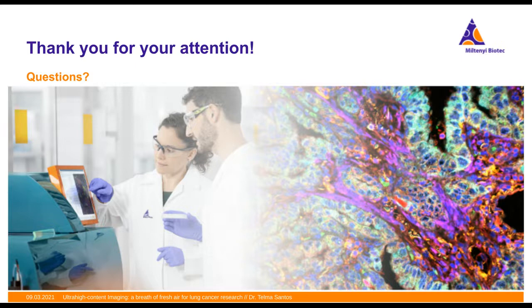We've got time for a few more questions here. Our next question, what is the resolution that can be achieved with this technology? So we have two objectives. One that can image through the microscope slides, which can achieve around 600 nanometers, and one for very thin glass, which can achieve around 400 nanometers.